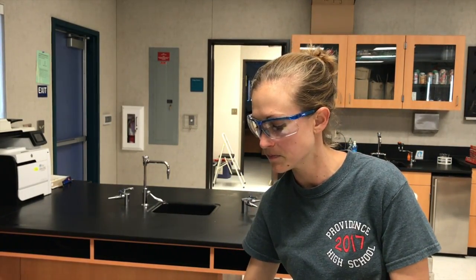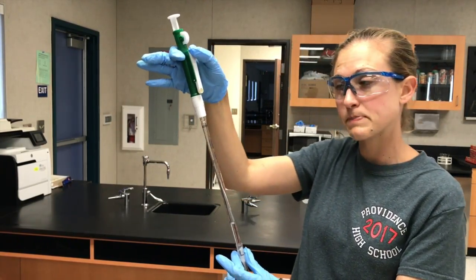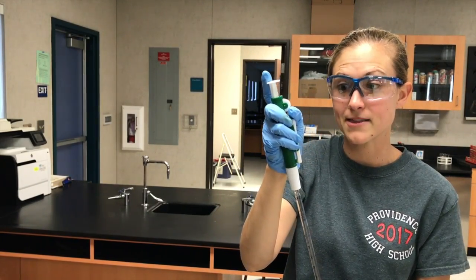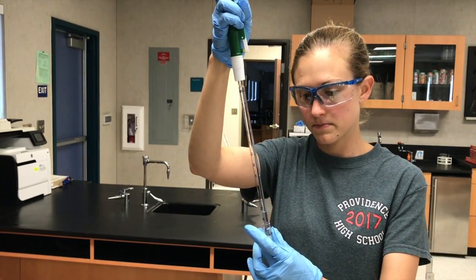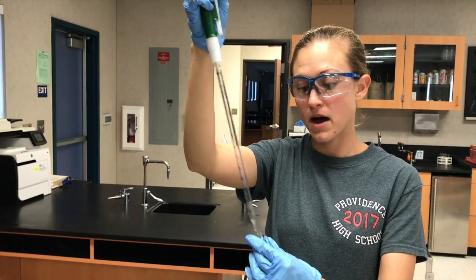Put my water down. I'm going to put it over the opening of my cuvette, and then I'm going to hit this button right here, which allows me to release. I can also just push this button here, and that will also release it. So I'm going to push the button. Okay. Now I've got 4 mils of water in my cuvette.